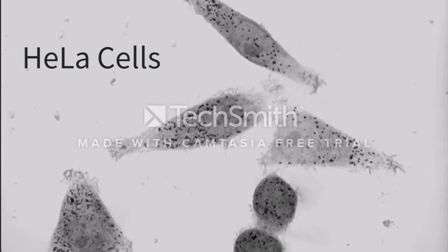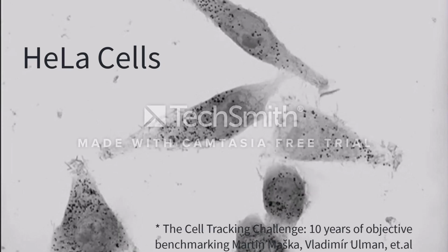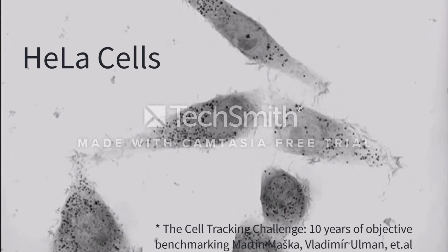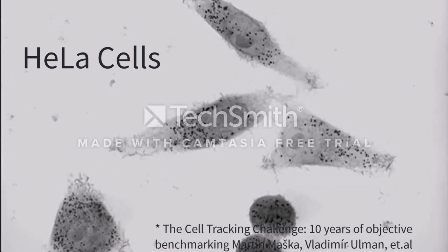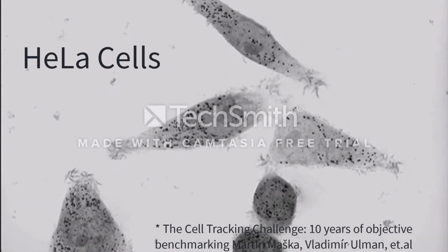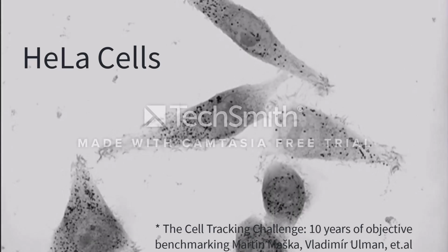dataset. This dataset contains two-dimensional images of HeLa cells that refer to a line of human cells that are widely used in scientific research and have played a crucial role in various medical advancements. The name HeLa is derived from the initials of Henrietta Lacks, the woman from whom the cells were first collected as a part of her cervical cancer biopsy in the year 1951.